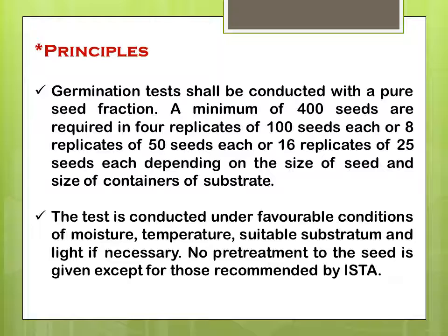The test is conducted under favorable conditions of moisture, temperature, suitable substratum and light if necessary. No pre-treatment is given to the seed except those recommended by ISTA, the International Seed Testing Association.